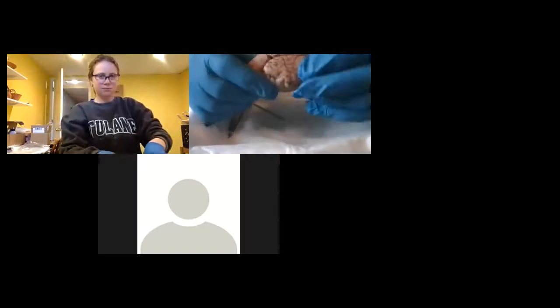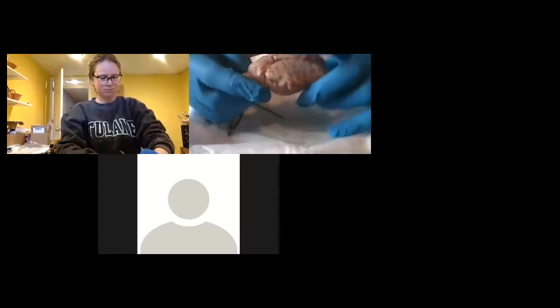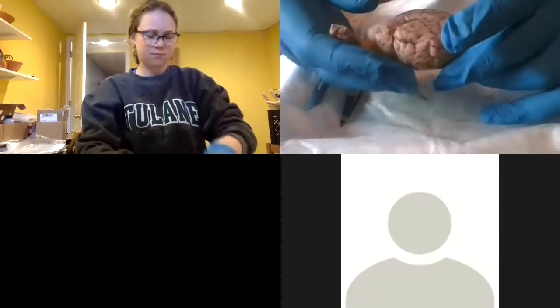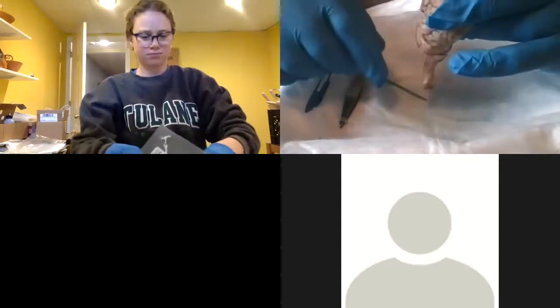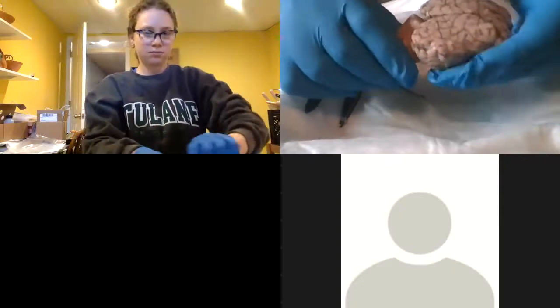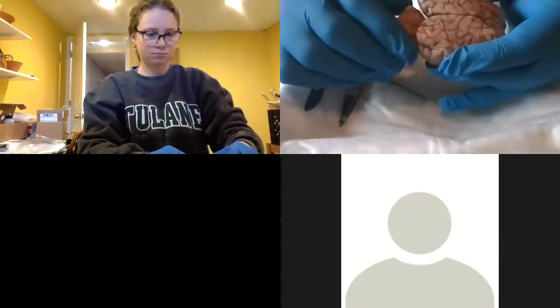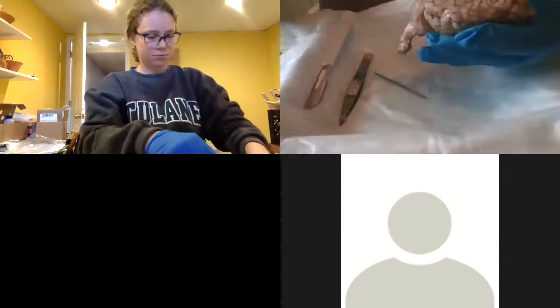So the sheep is a quadruped. So his brain is like this with dorsal side and then ventral side on the bottom. Human brain more vertical, right? So the spinal cord will start off here. So the first thing I think you should notice is the cerebellum posterior dorsal. And then you could see the two cerebral hemispheres.